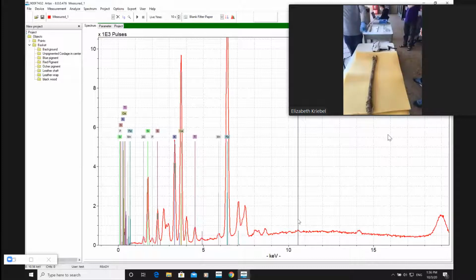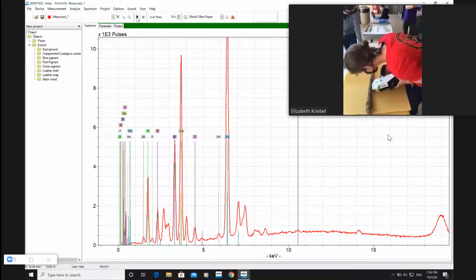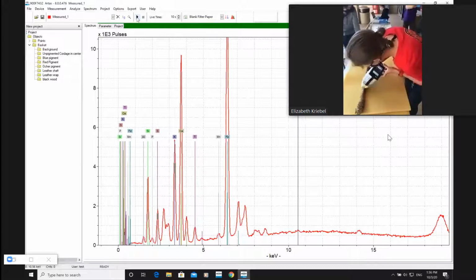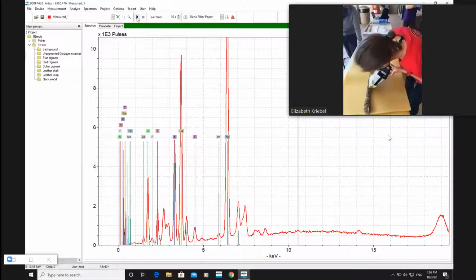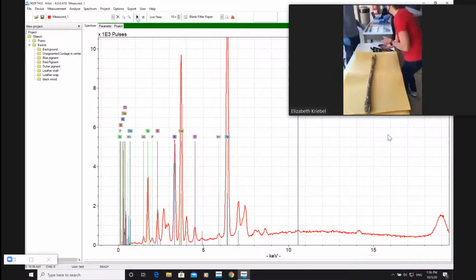I'm guessing we're going to measure this. Yeah, these yellow spots, and the iron's going to shoot up. Let's go ahead and do that right now. All right. So like this. Yeah, one of those clay spots that he was talking about. Let's see what it is. We'll either see aluminum and silicon shoot up if it's a clay, or if it's an ochre, or both, frankly, because ochres can often be mixed in with something to make it more neutral. I need a gloved hand to hold this guy still. It's too rolly.